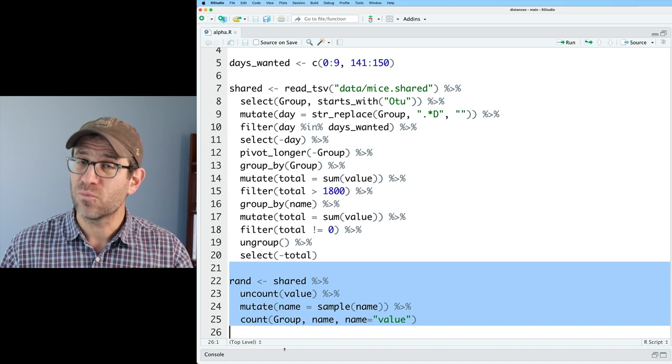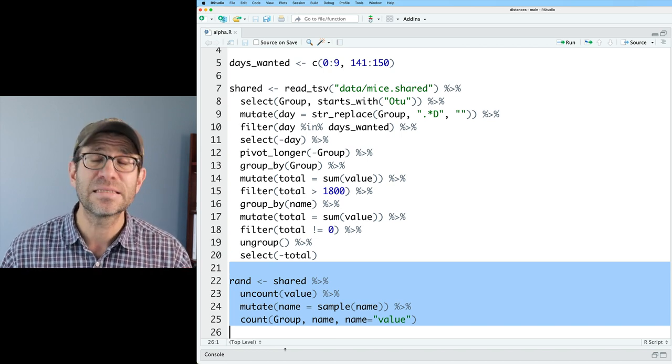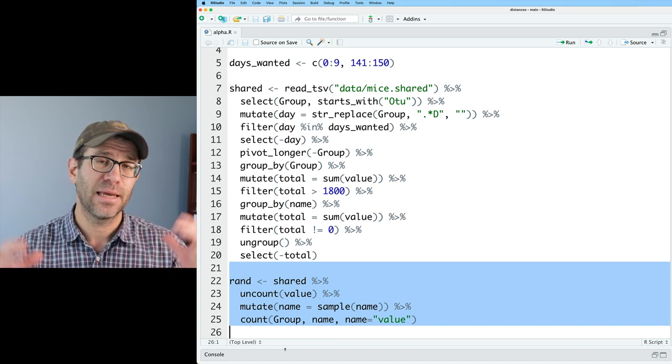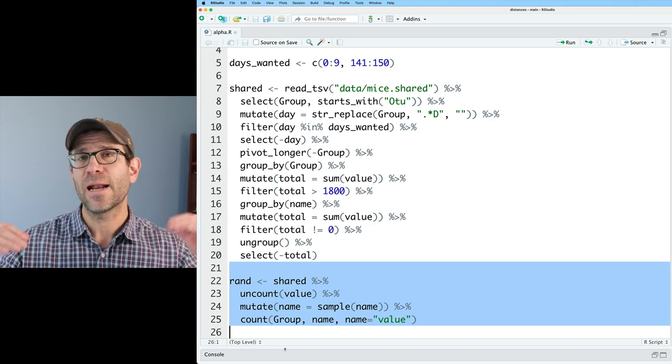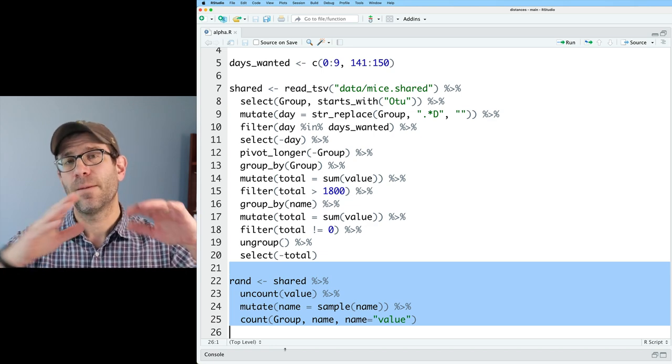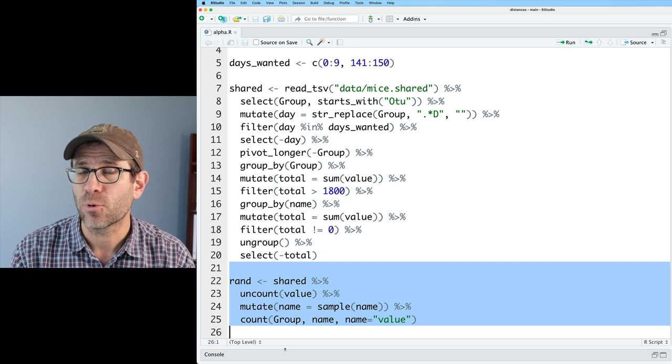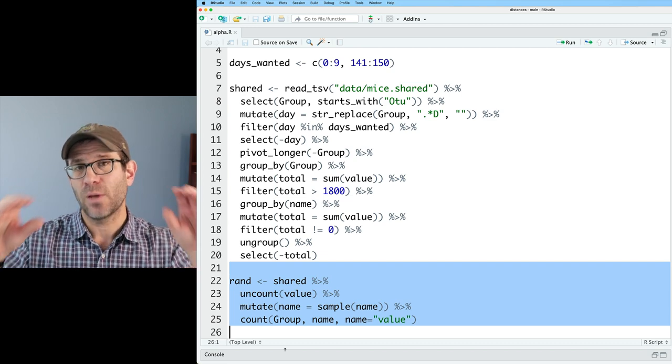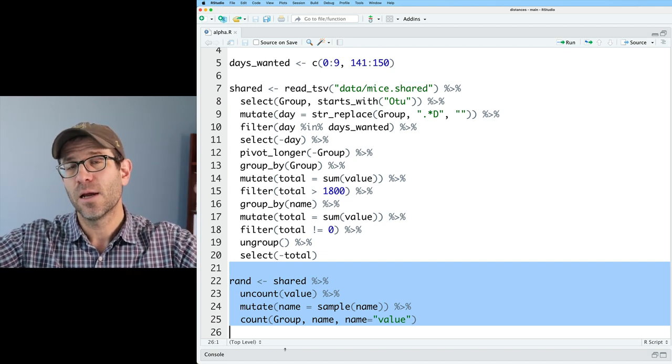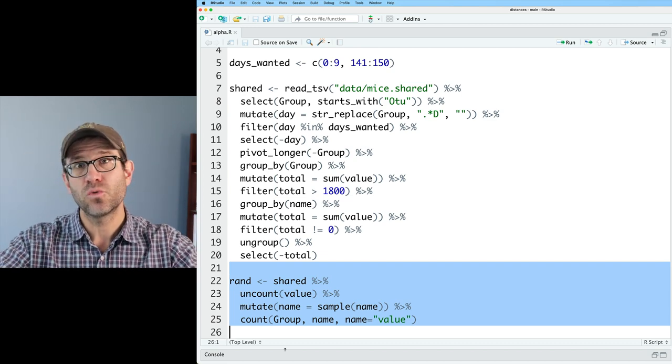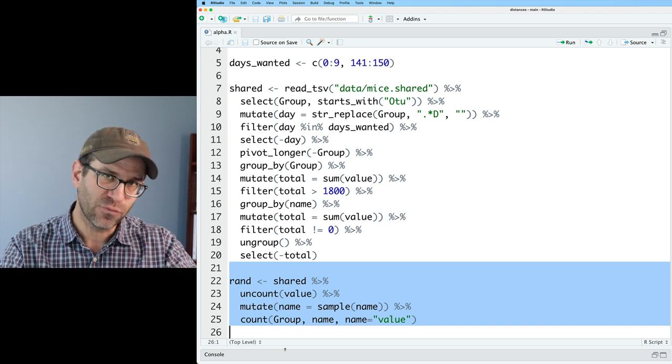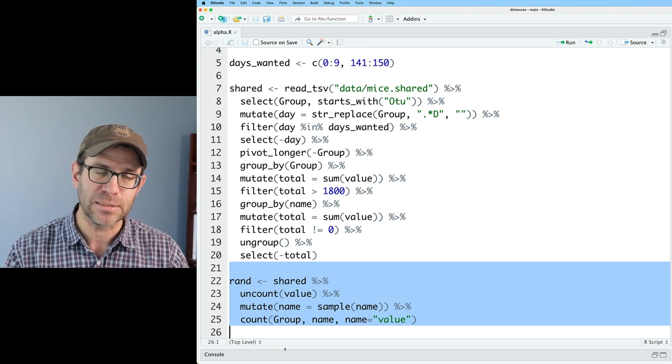I then have code to generate a RAND data frame. What RAND is, is that this was created by taking all of the data from shared, and I pool all the counts, but keeping each taxa separate so that we have effectively a meta community that we then sample from to regenerate the distributions for the 225 samples in this study.